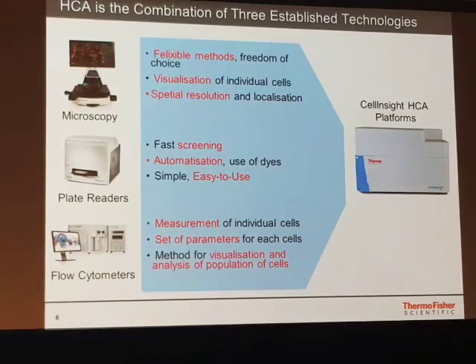And that brings me to another point, to drive back my main message. What is high content screening? When I ask you, what's the difference between a zebra and an elephant? Well, one is a very large animal, right? It's gray, with a long nose. The other one is a little bit smaller with black and white stripes. So that is what high content screening is doing for you. It characterizes the cell based on certain characteristics, how they appear, and then analyzes it.